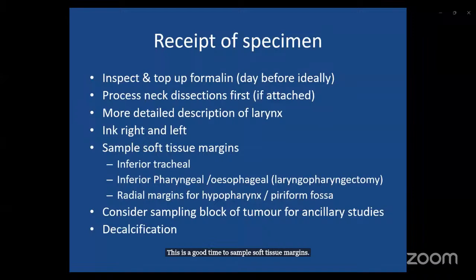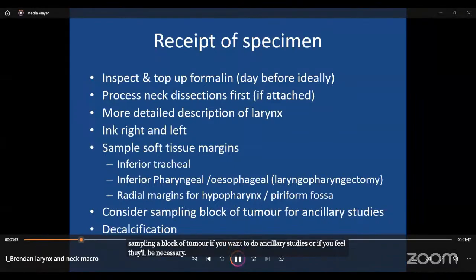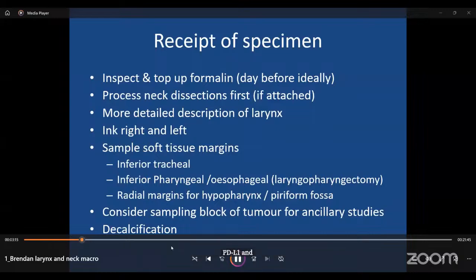You can also consider sampling a block of tumour if you want to do ancillary studies, or if you feel they'll be necessary, PDL1 and things like that, and then it can go for decalcification.